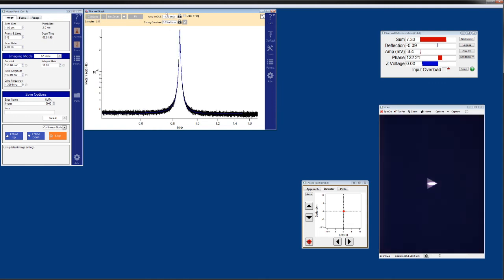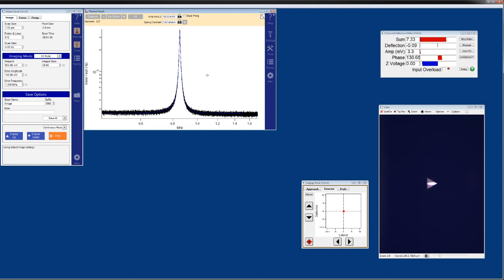Now, the two values have just been updated because they are calibrated. You can immediately start doing quantitative force curves, nanomechanical measurements in bimodal AMFM or just start to think of cantilever deflection and amplitude in terms of real units, not volt or millivolts.